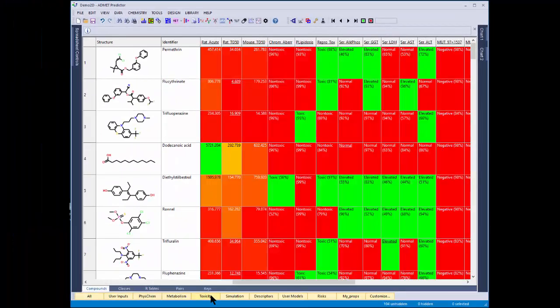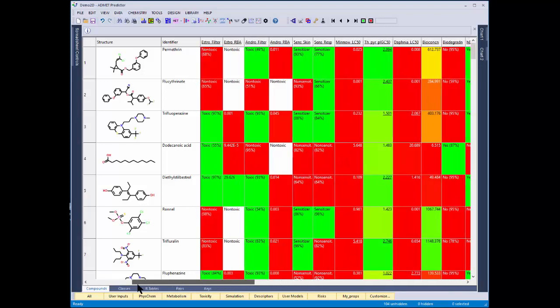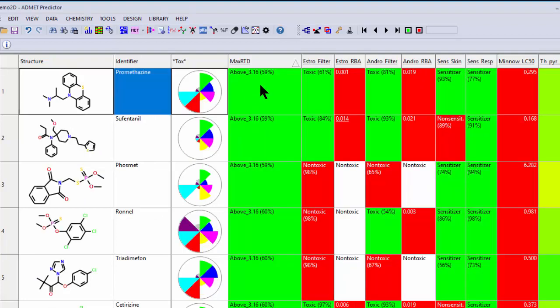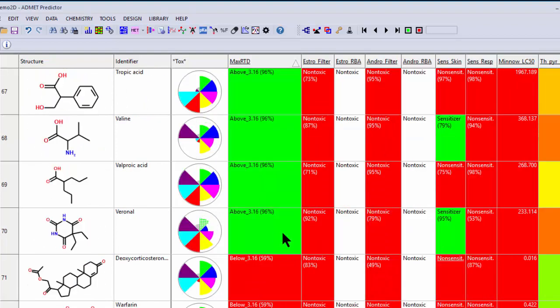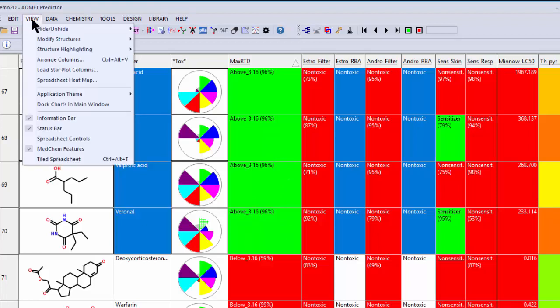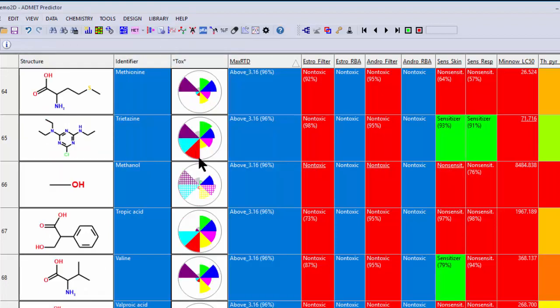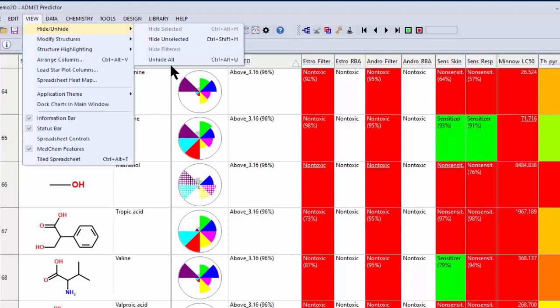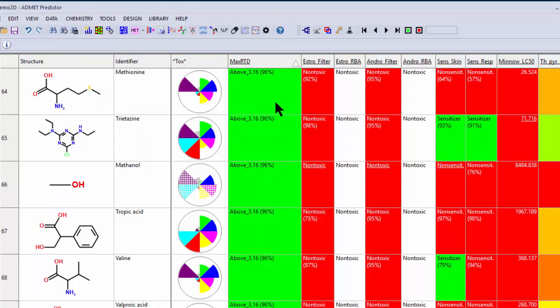Let's go over to the toxicity values. Even here, things that are classification models will also be displayed in red-green. We have the above class in green, the below class in red. If we sort these and select just all the ones that are above, hold down Shift to select all those rows, then go to View, Hide, Unhide, and hide selected — you'll see that the colors have disappeared for this property. This occurs because all of the values are the same, so the program doesn't know what color red and what color green to assign, and it just makes the white background. But if we go back into View, Hide, Unhide All, we'll get the colors back. I use these colorings with everything I do — it's very convenient to get a quick visual on the data.